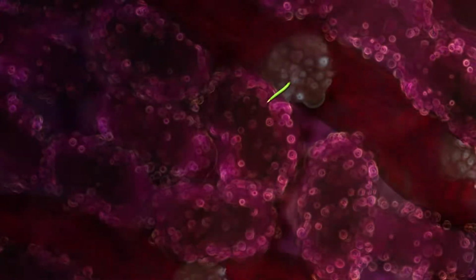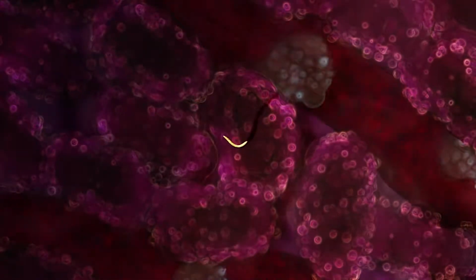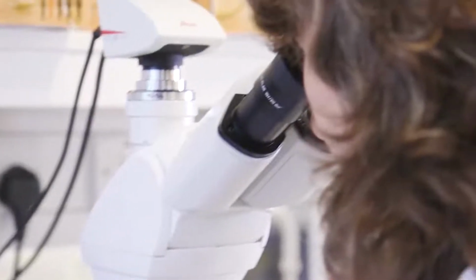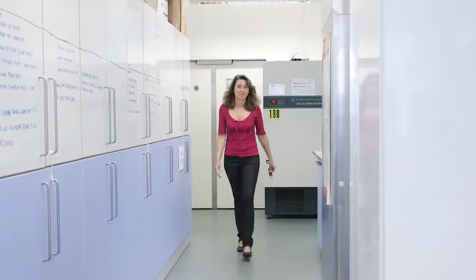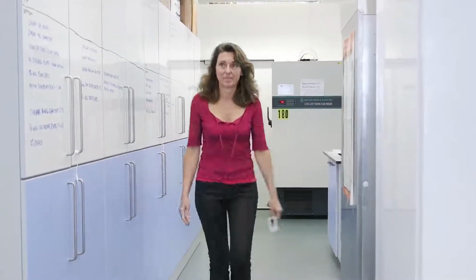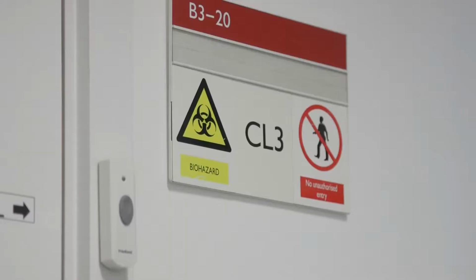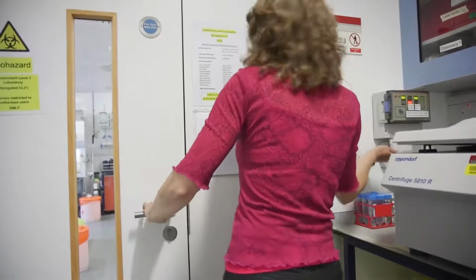The malaria parasite has a complex life cycle and in the human host goes through several stages. In the lab, I concentrate on the blood life cycle. Malaria parasites are infectious organisms, so in order to work with them, we need a special lab. These are CL3 or Containment Level 3 laboratories.